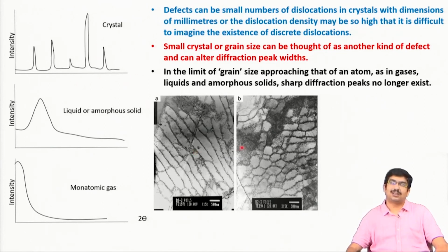This is a thermomechanically processed iron, and you can see that it has a typical dislocation structure, which we call substructure. We will discuss this dislocation substructure maybe in the next lecture. Just because of the presence of a high amount of dislocations, we get this kind of structure within the material. So the grains are even more subdivided into smaller crystallites, and the size is decreased. All of these are defects, imperfections within the material, which take the real specimen away from idealized conditions.